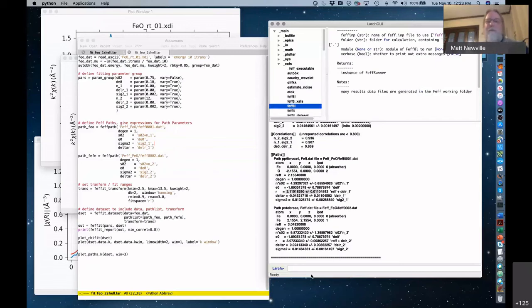I just want to mention that this sort of tool will be covered in session 4, because EVAX, developed by Yanis and his colleagues, is doing pretty much this thing. It does it in a little more complicated way, because it reveals the whole structure, and then it tries to find the best fit on every iteration. So it recalculates the whole FEFF set on every iteration, which is very time consuming, but the most accurate approach.